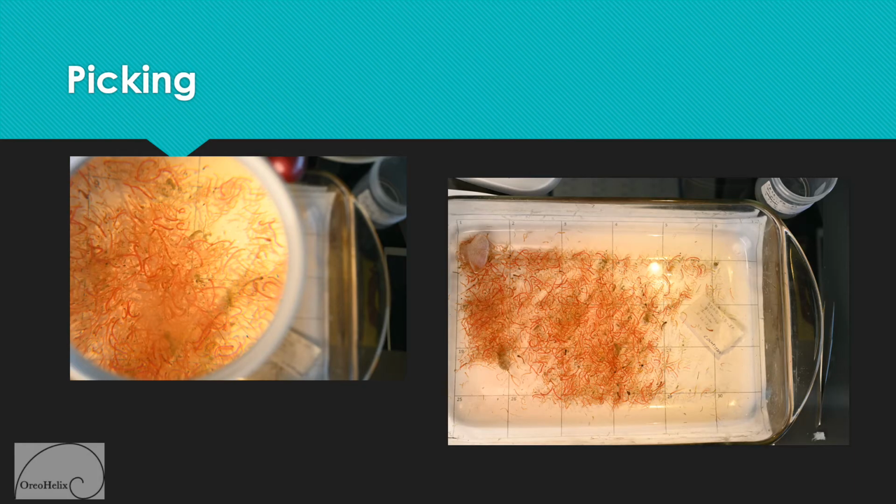Live invertebrates were hand-picked from detritus within 48 hours after collection from the Farmington Bay wetlands. Typical picking times were between 4 and 8 hours per picker. Residuals from primary picking were then quality control checked by a second, different picker. Residuals were then combined with original pick samples. In these images, clean, hand-picked samples are ready for taxonomic separation, counting, oven drying, and dry biomass weights.